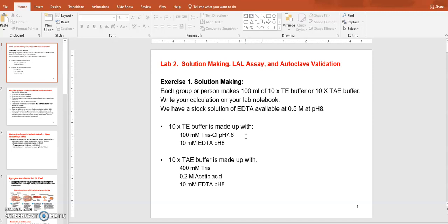Of course, the first easiest method will be what? Define the weight of a chemical per given volume. So weight per total volume of your solution. Another way of describing solution making would be what? Molar solution. 1 molar, half molar, 2 molar solutions. So it depends on the molecular weight of each compound. You will dissolve that chemical into a certain solvent, water or whatever else.